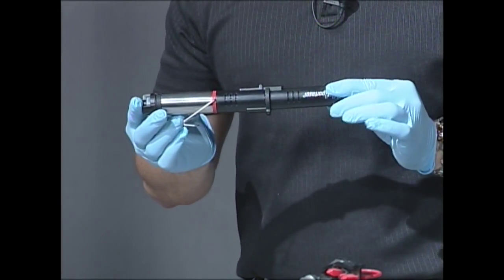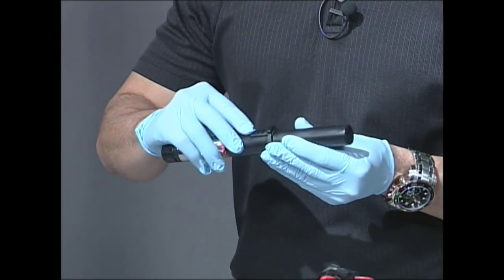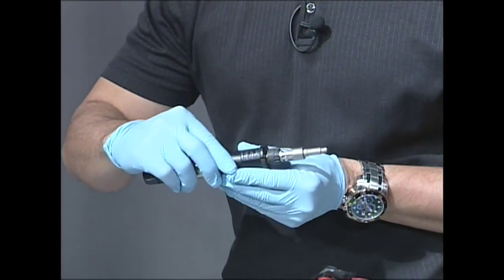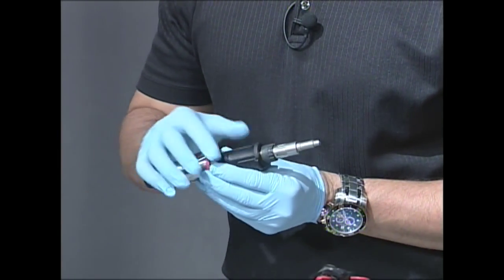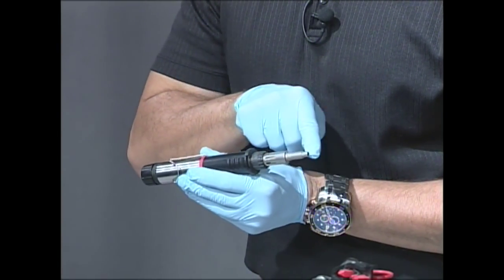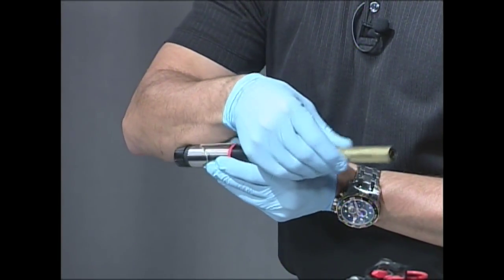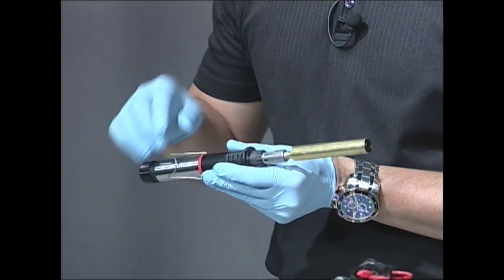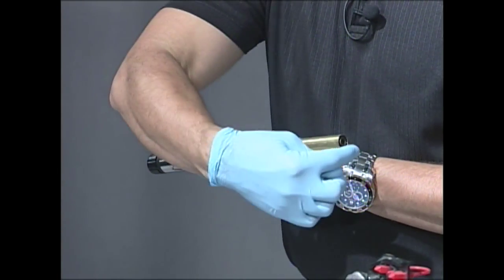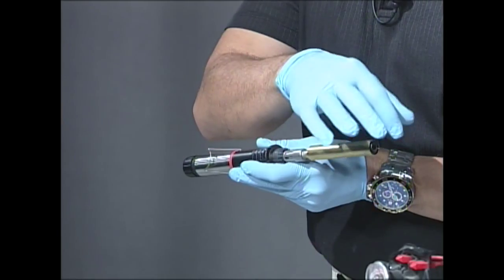Here's our fuming wand — it has the on switch and also the switch to turn on the gas. I'm going to pull the cover off, and quite simply, once we turn the gas on, we're going to ignite it and that's going to heat up this element here. Once we put on the adapter at the end — this is filled with superglue — once this heats up, the fumes are going to come out of the end and then you can fume your item.